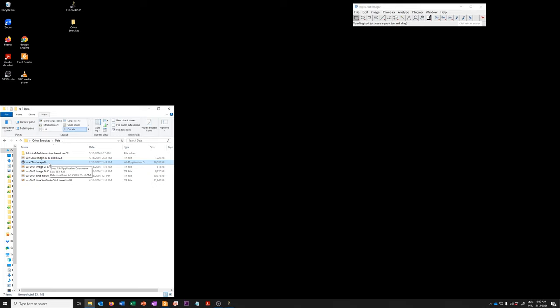What I'm going to show you is what this data looks like and how I reduce it to the kind of data we will analyze in the rest of this co-localization set of exercises.